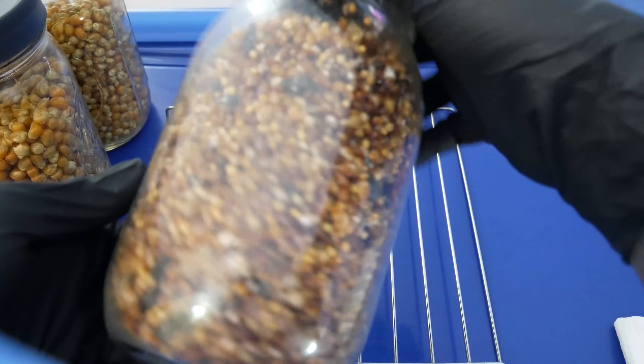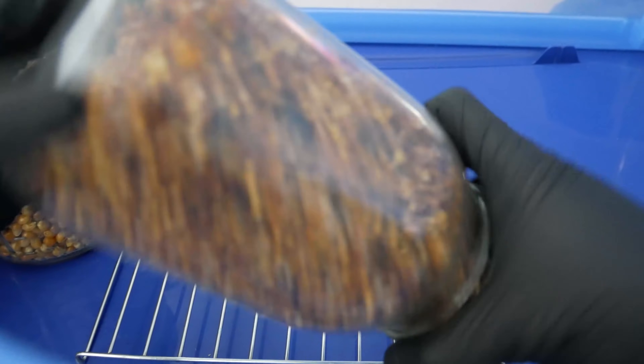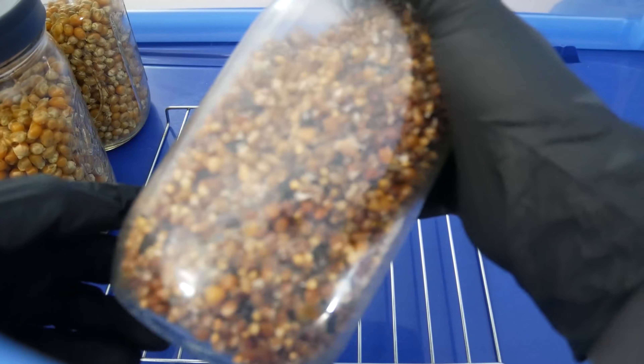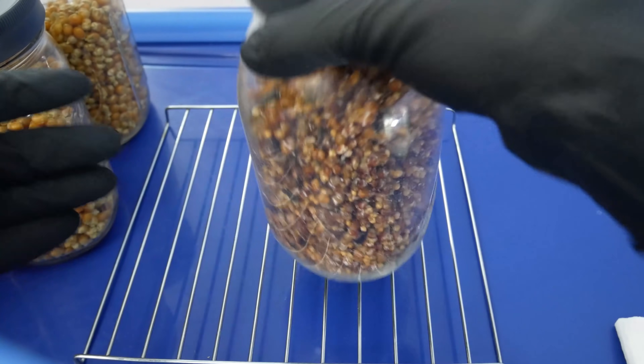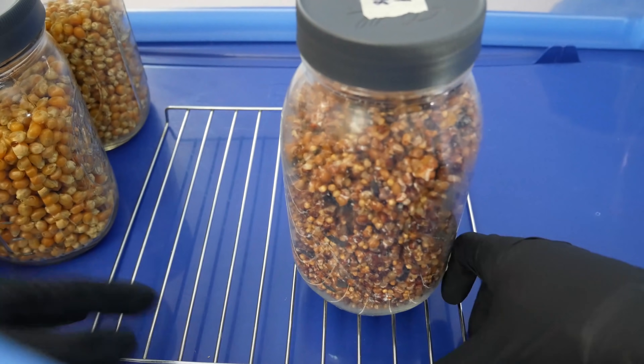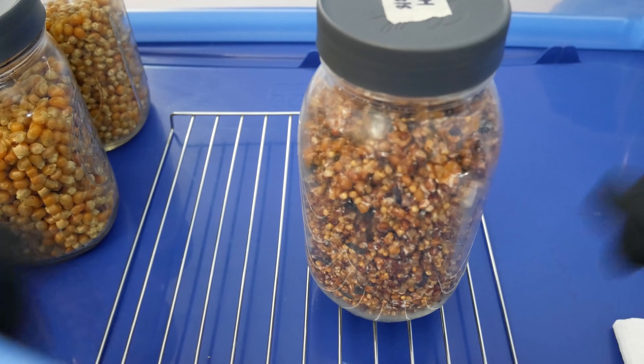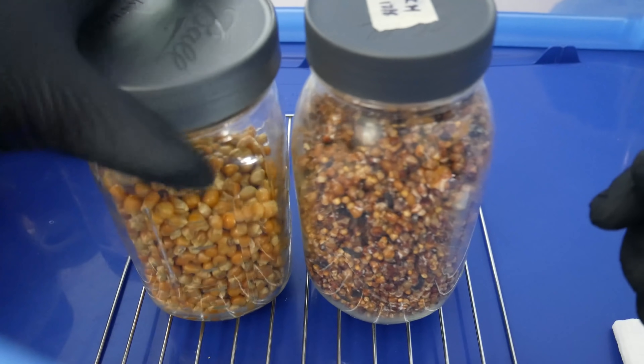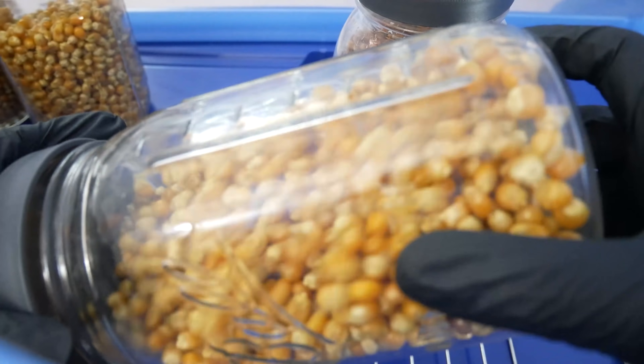After doing grain-to-grain transfers, I can achieve a fully colonized jar in as little as 14 days. Among the different inoculation methods, grain-to-grain has always been the fastest in my experience, followed by liquid culture, then agar, and then spore syringes.